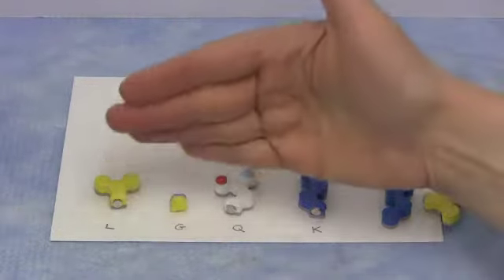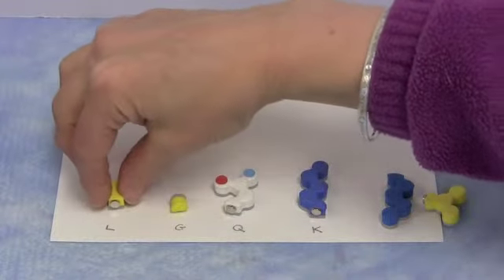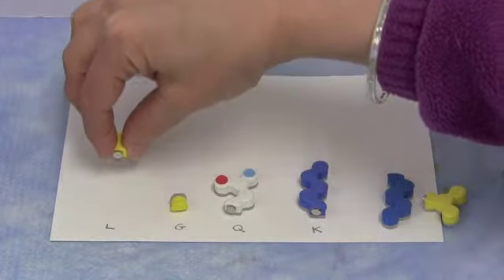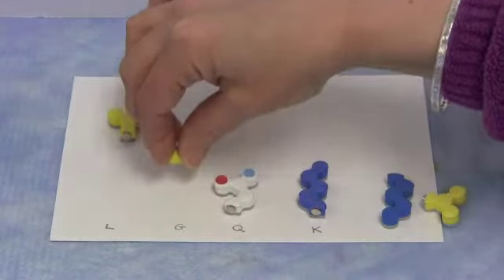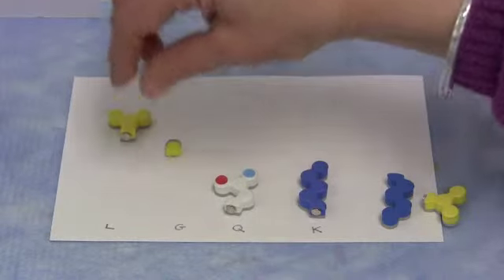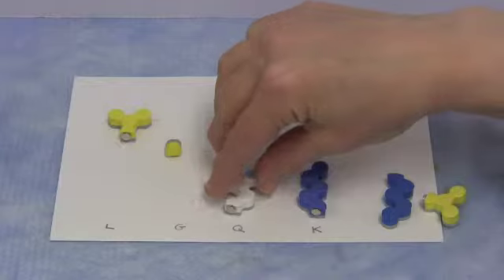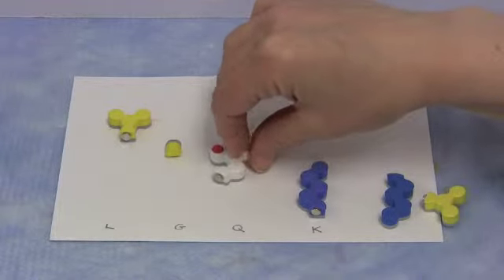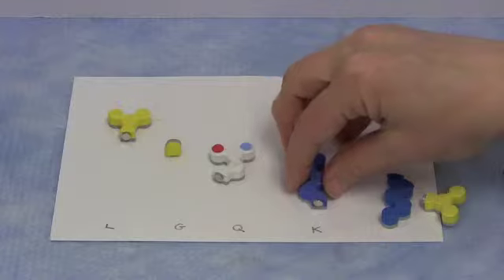So let's think, as our mobile phase hits these molecules, they're going to move at different rates. So our leucine is going to spend more time in the mobile phase and will move up furthest. The glycine, again, is relatively non-polar, and it'll move up fairly far. Our glutamine is more polar. It doesn't have a very high affinity for the mobile phase, so it will move some way, but not very far. And our lysine, which is really polar, isn't really interested in getting dissolved in that mobile phase. That's hardly going to move at all.